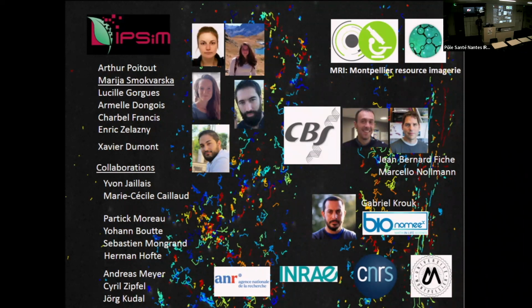Do you have other questions? No. Maybe in general, could you tell us in your mind what's the major hurdle of doing single molecule imaging in plants? Well, before starting, I would have said that the main difficulty is actually to get data out of the microscope, and this was really easy.